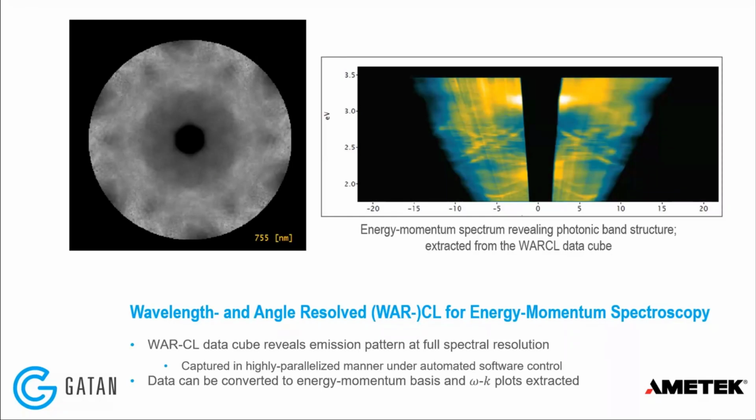So we have this really powerful tool that allows us to determine the photonic band structure of materials and to directly correlate that with the structural information that you see. So the uniformity of the periodicity of the shapes, or directly understanding the influence of a missing pillar in the array or something like that. So it's a very powerful way of developing these advanced devices.